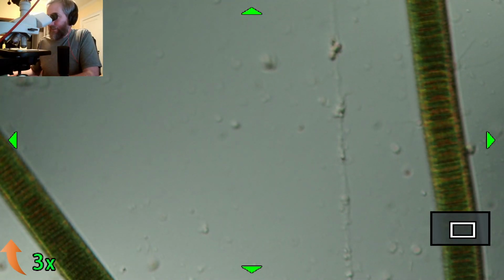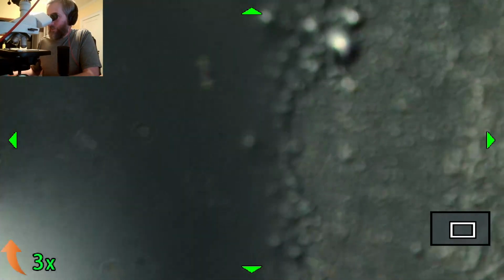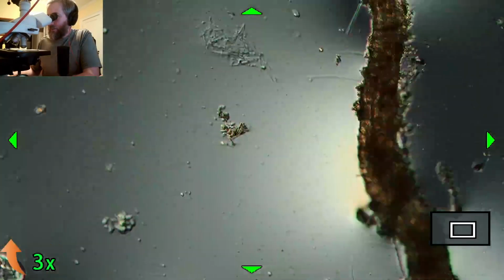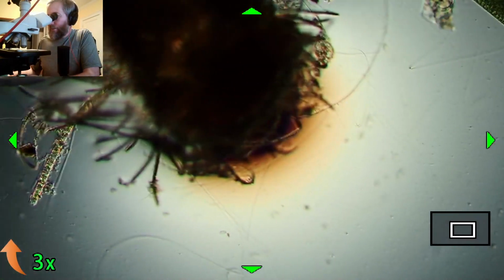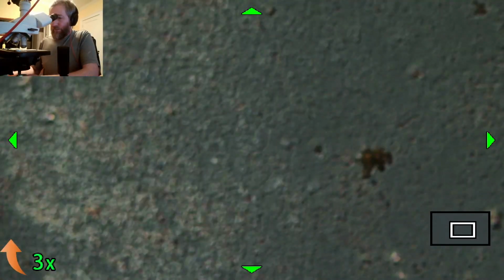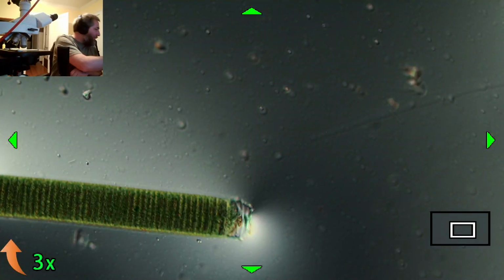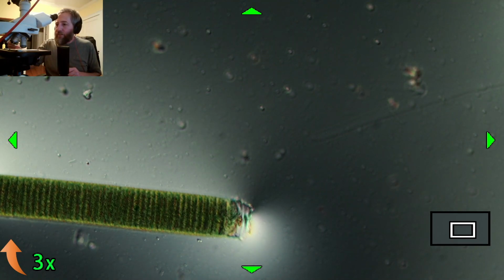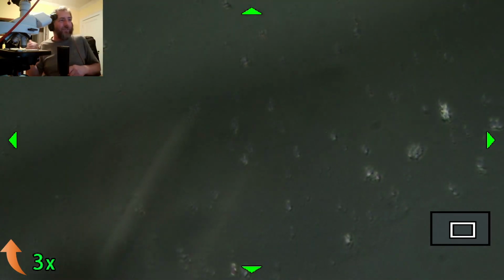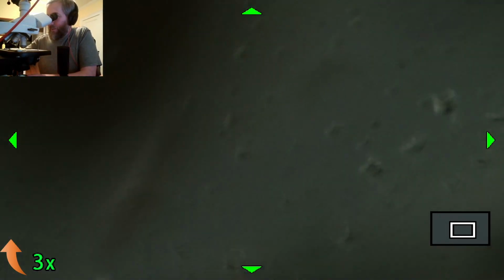So it finally got tired of us being here. Oh, there it is. Let's go look around. The slide's starting to dry up a bit. And I think all this out here is kind of dried up. And it's because I didn't put a cover slip on it. And it's gonna get problematic for everybody here in this slide. But because I didn't put a cover slip on it, I can also just add a little bit more water to the actual slide and hopefully hydrate all of the organisms here. And maybe we'll find something new.